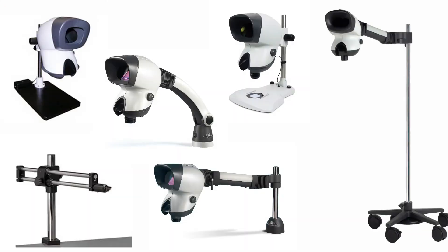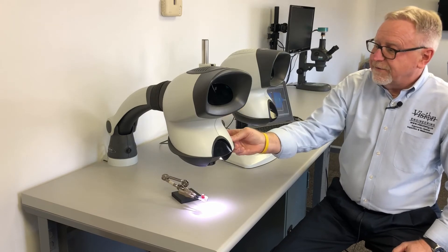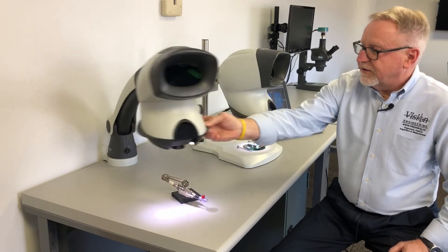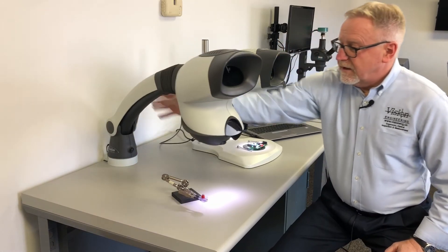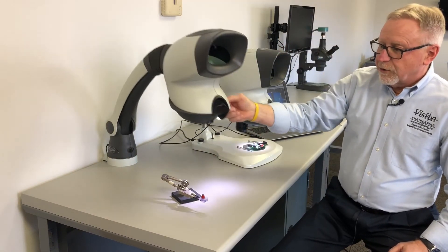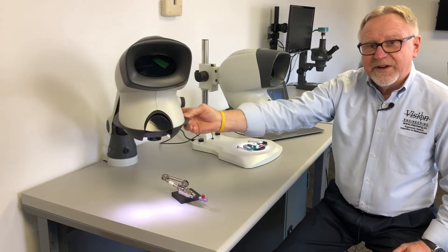Mantis systems come with multiple stand options. The most popular stand we offer is our universal or boom stand. It offers great flexibility and easy articulation. You can move it out of the way when you're not using it, easily adjusts for height and focus, and fits a wide range of operators.